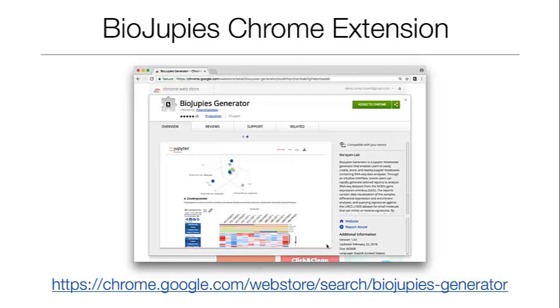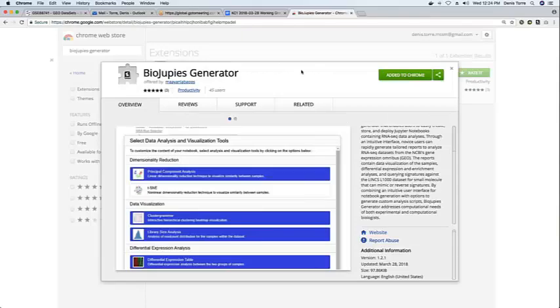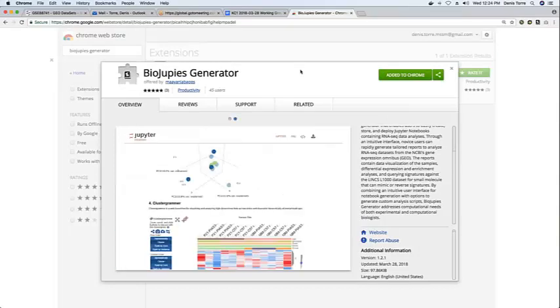Chrome extensions are very simple and lightweight plugins which can be installed for free from the Google Chrome Web Store on your Chrome browsers.